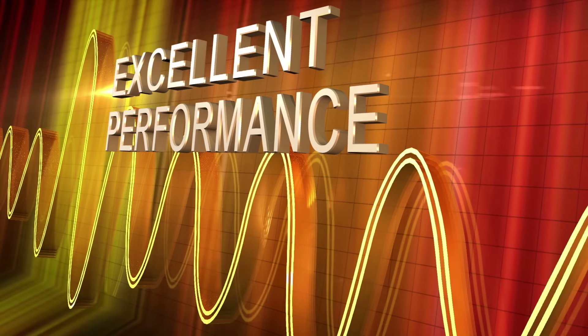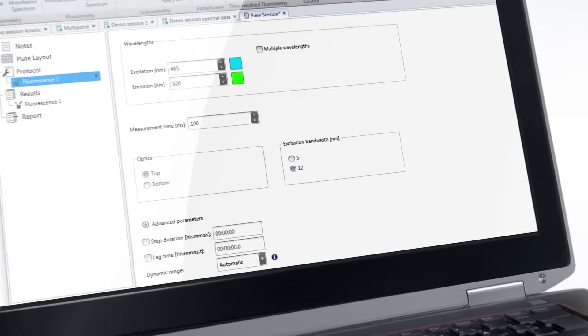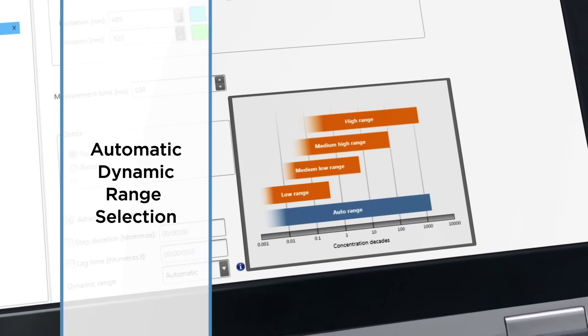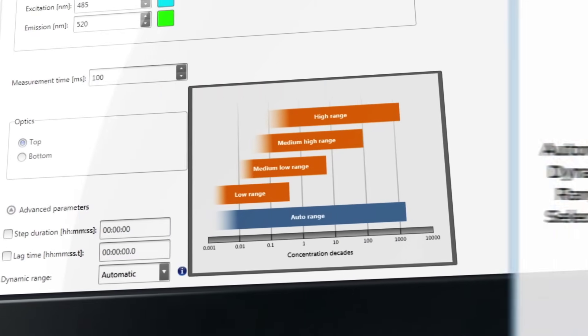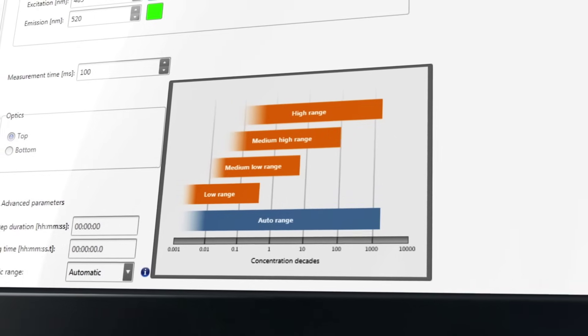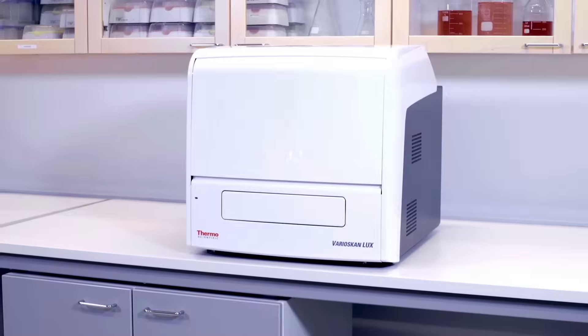For excellent performance, the VarioScan Luxe delivers high sensitivity even in the most challenging applications. Plus, it features dynamic range selection, adjusting to the optimal measurement setting for accurate results at all signal intensities.